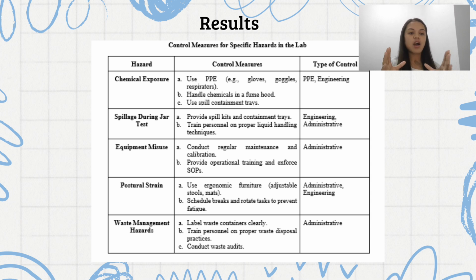The hierarchy of controls, which ranks the best risk reduction strategies first, serves as the foundation for the application of these measures. The hierarchy of controls, arranged from most to least effective, organizes the methods of risk management.